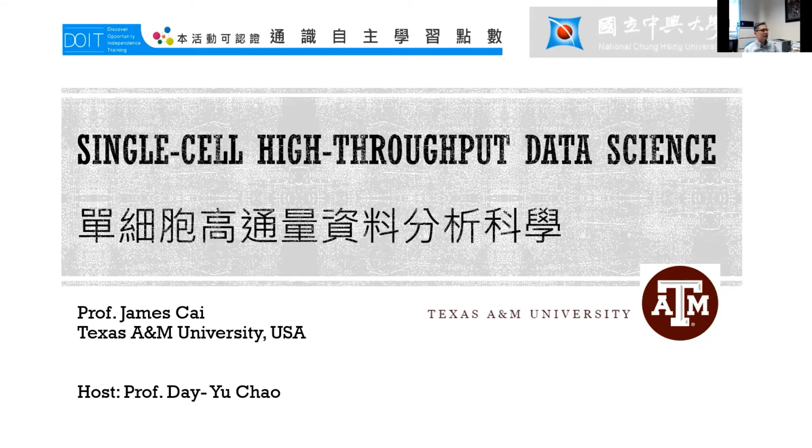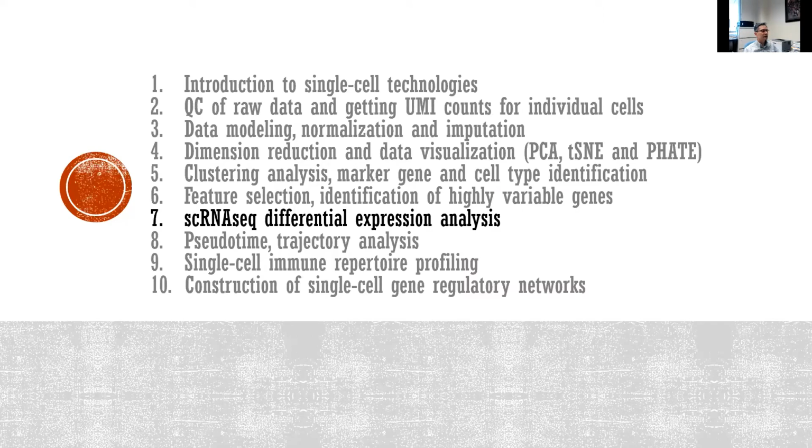Welcome to our lecture number 7 on single-cell high-throughput data science. So today we are going to talk about single-cell RNA-seq differential expression analysis, so-called DE analysis, DE.